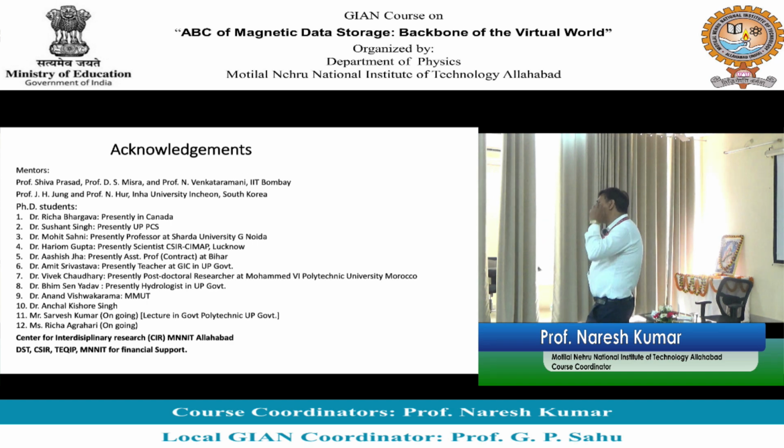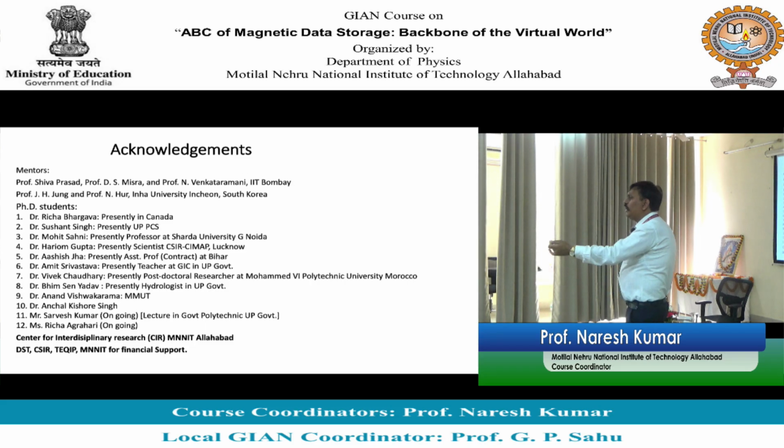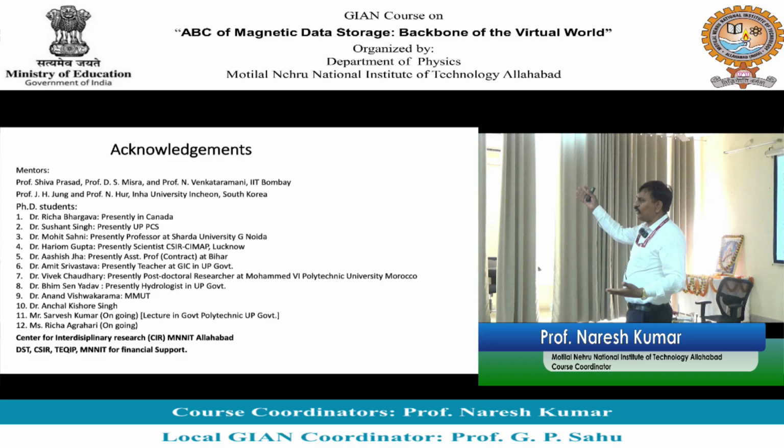So that is why it is difficult. मतलब इसको बहुत ऑथेंटिक बोलते नहीं है. A qualitative analysis you can always do if you are performing an experiment with just one sample. टेम्परेचर में अलग-अलग टेम्परेचर रख रहे हैं या कूल डाउन कुछ और कर रहे हैं. So qualitatively you can always say कि by changing temperature particle size is increasing or it is decreasing. So that statement you can easily make.